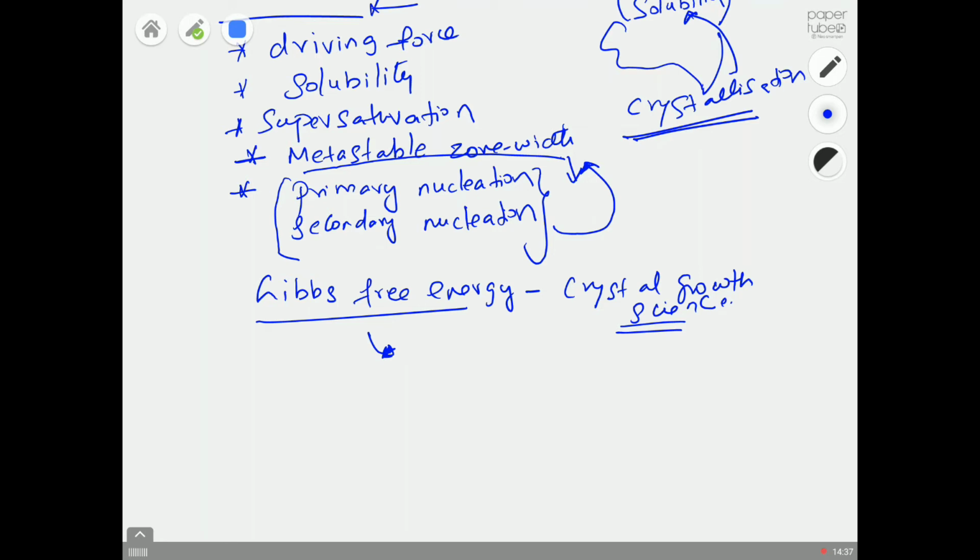And then just a note, crystallization always produces very beautiful crystals of different shape and size. Doing an experiment is very simple. All you need is to go to a lab, make everything clean, add the reactants, add the solvents, and know a bit of theory, and then you can make nice crystals. But it's a very tough concept to understand, to expose the crystal growth mechanism. That's really a tough business.